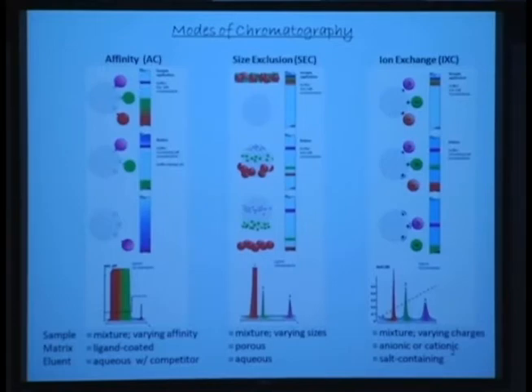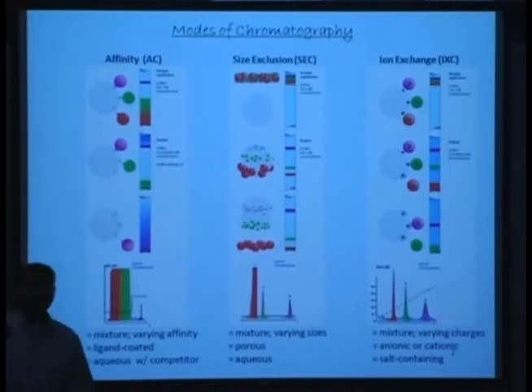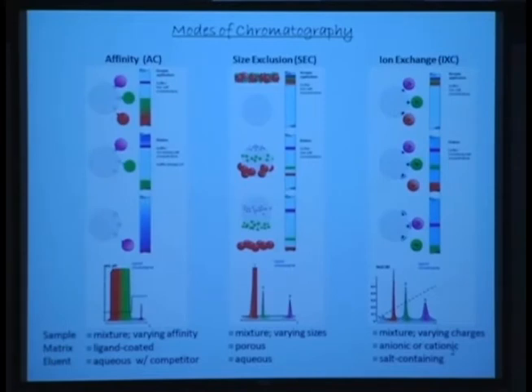Milligram quantities of these N-glycans is a luxury, really a luxury. So if you are trying to separate microgram quantities from gram quantities of sodium chloride, you have to do it extensively. There are desalting columns available which are many times based on PEG, and they have an efficiency of close to 90 to 95%.